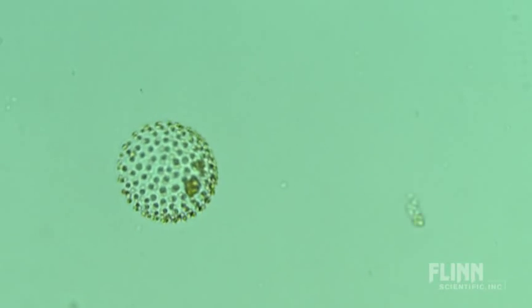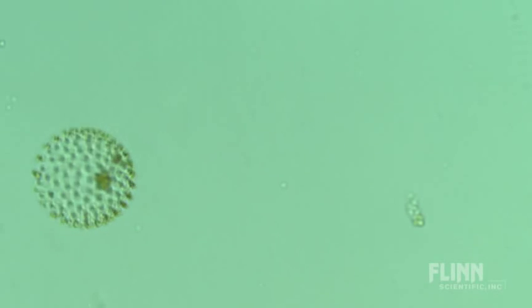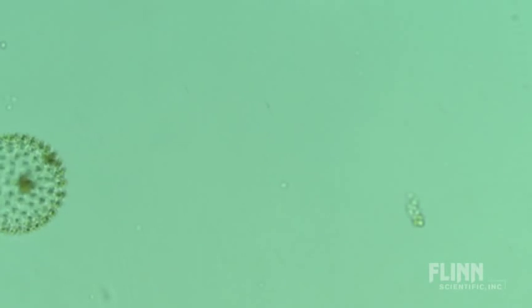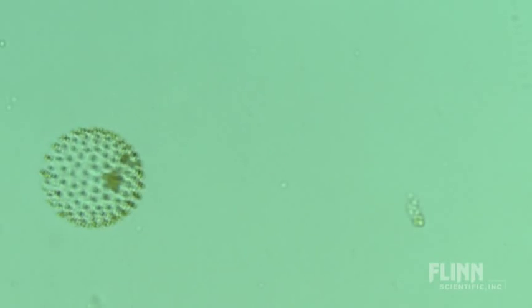When students find the volvox, often there will be daughter cells inside of it, small colonies just starting out. Those daughters can be either sexual or asexual products of reproduction.